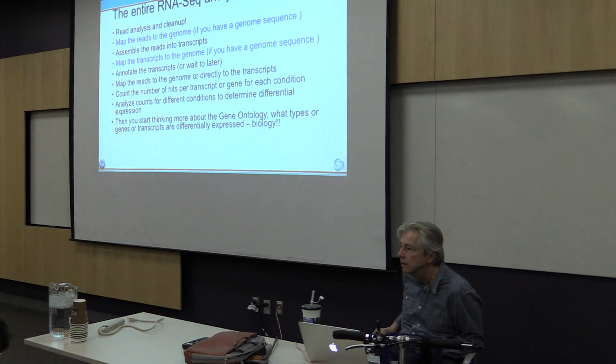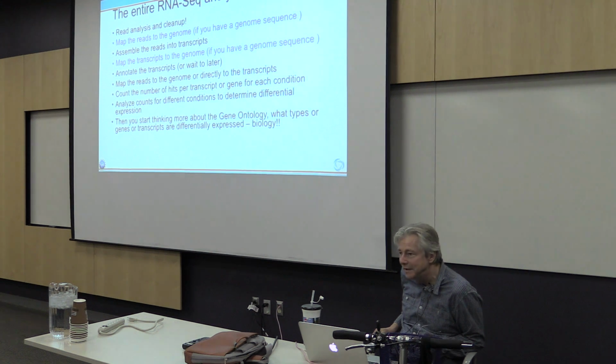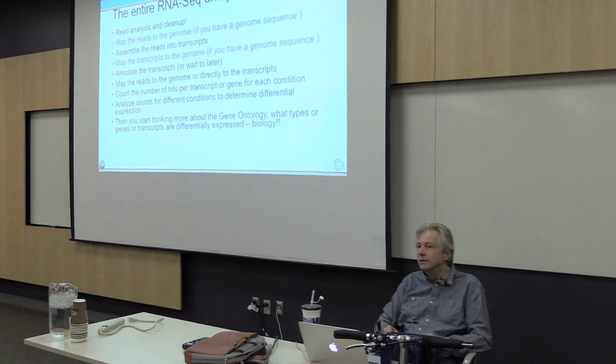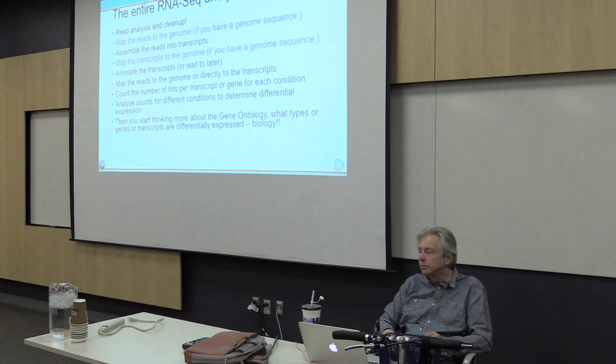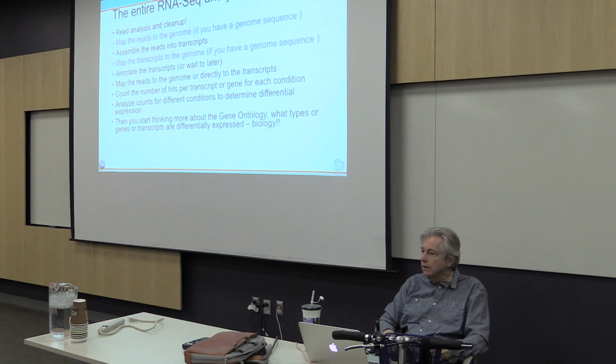We're not going to be doing that today, unfortunately, because if you worked with me and you did what we are going to do today, which is just take your reads and start analyzing them without cleaning them up, I would get upset, because one of the things that I've learned, and I was by far not an expert when I started doing this stuff, is I learned the hard way that if you don't clean up your reads, you're putting a lot of junk into the analysis, and you're screwing up the process.